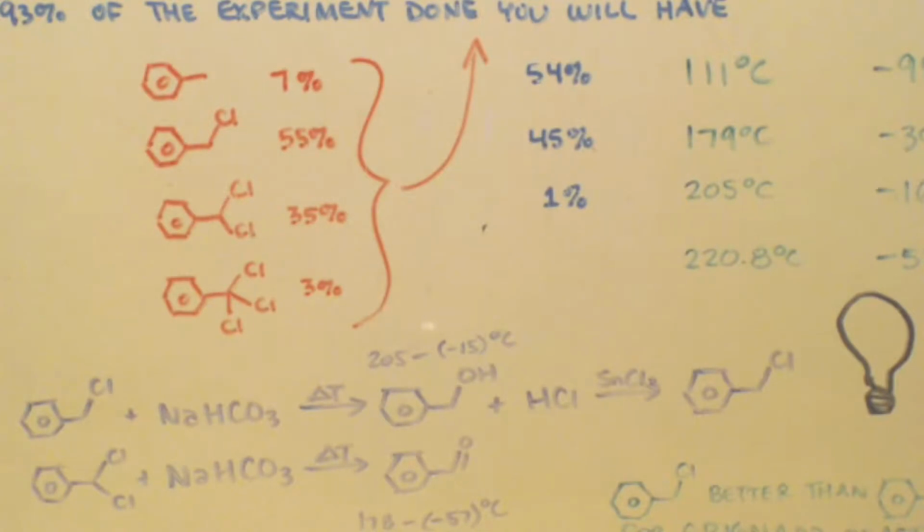And so when you do this reaction, I showed you the apparatus, how you'd have the HCl gas that you're making coming out and going into a suckback trap and then a scrubber of sodium hydroxide. Now, if you take off the scrubber, the only thing you should smell is hydrochloric acid. If you smell any chlorine, that means the reaction's over. You should not smell any chlorine whatsoever, none. Okay? If you are, then you need a better UV source.